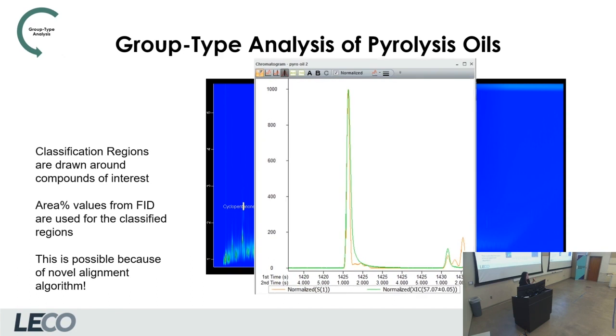We've got the S1, the FID trace, and our alkane. When we normalize, you can see you've got exact alignment, and that looks like this all the way throughout the chromatogram for all of your major peaks. And so if I had plotted like 105, you can see that where that S1 trace, those smaller bumps would then line up perfectly as well.